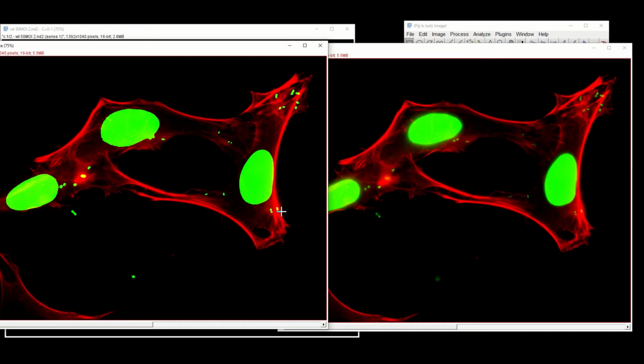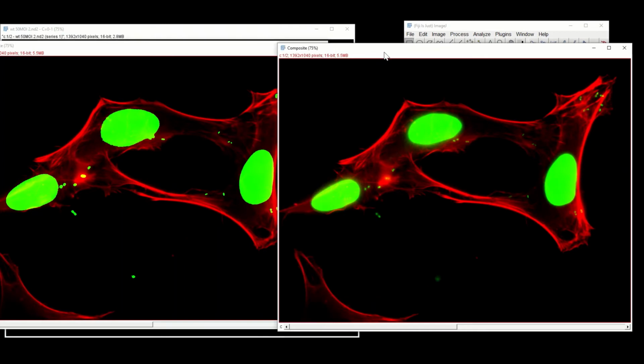Now, in terms of the quality of the data, you lost quite a bit of data in performing this exercise. Okay, so it's very difficult to see, of course, how big this bacteria is. It's very difficult to do anything with this particular data, but nonetheless, it's a useful tool to be able to visualize those little tiny bacteria. And once again, I would like you to appreciate the difference between these images that were acquired with a 100 times oil objective and the previous image that was acquired with a 60 times objective. It was an air objective. So different kinds of objectives, of course, give you different kinds of resolutions.